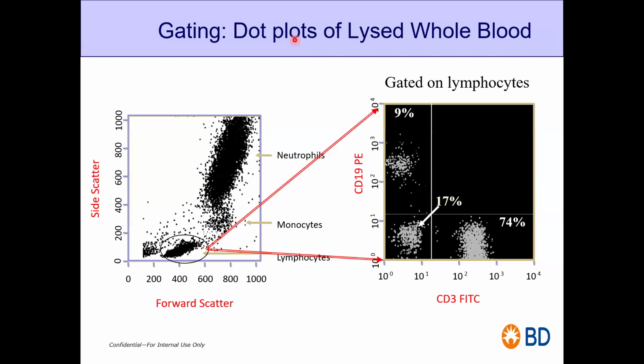Okay, just a general question. What does a lymphocyte have? It has B cells, T cells, and one more cell type, right? NK cells. Yes, they are not CD3 positive, neither are they CD19 positive. So whatever is there, those are your NK cells.